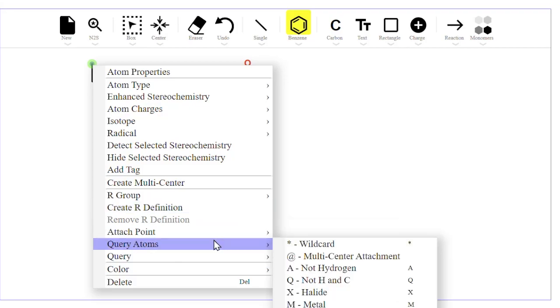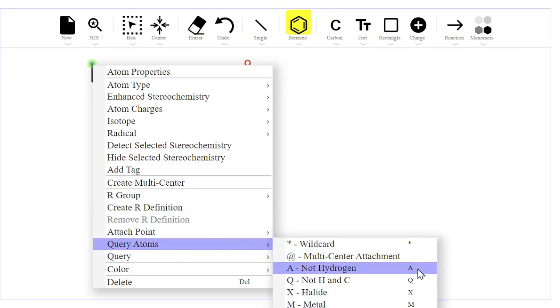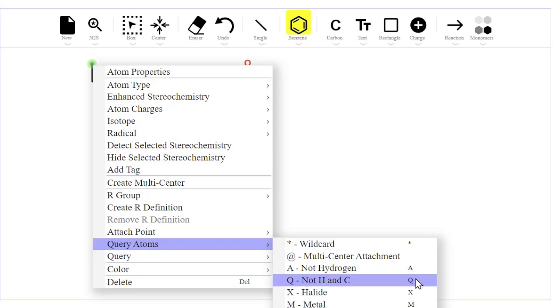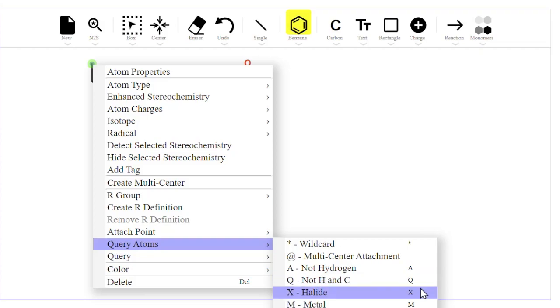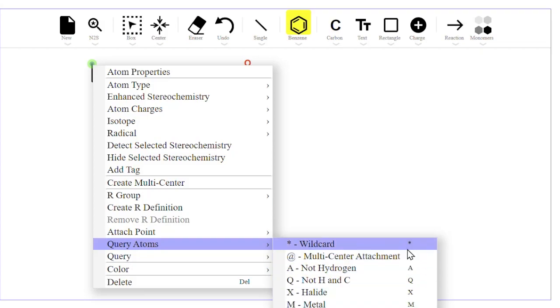For query atoms, typing A gives you the non-hydrogen wildcard, Q for not C or H, X for halide, M for metal. These are useful in searches. Asterisks will indicate a wildcard at that position.